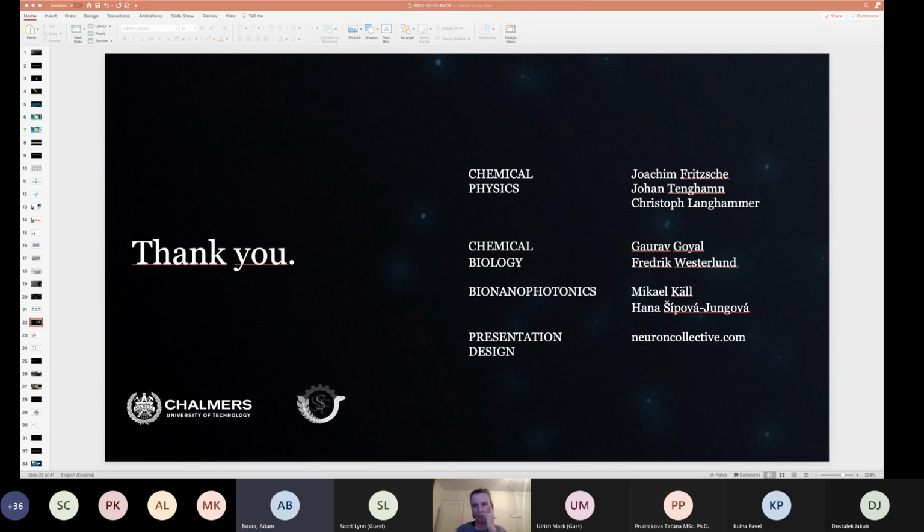Yeah, you can. Like for instance, how electrophoresis is done. It's probably that. But for now, we're working with basically pressurizing the inlets. It's how we flow molecules. But yeah, you can also think about introducing some kind of electrostatic traps. You can trap the molecule and maybe observe it for a longer time if that's needed. But that's all, just ideas right now.